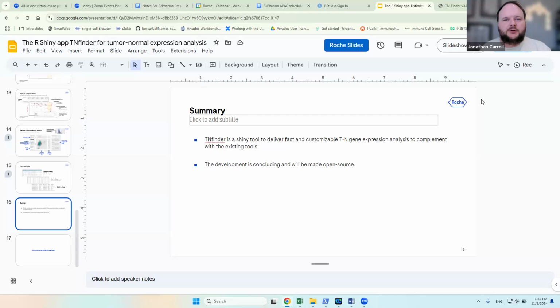If no one else does, I had one. So showing expression data when you change the number of filters, one thing I've always found to be very slow doing that is having to do renormalization based on the subset. Is that something that you skip here, or is that all pre-calculated?